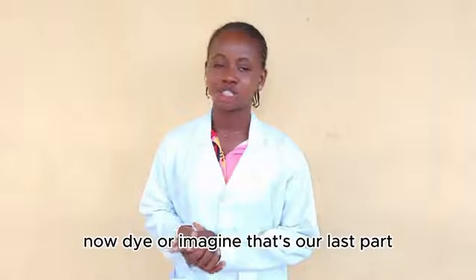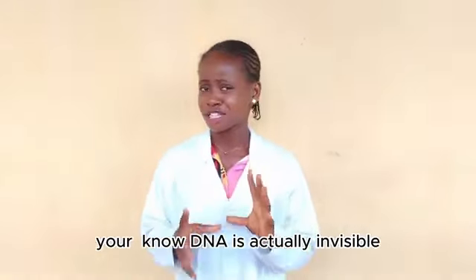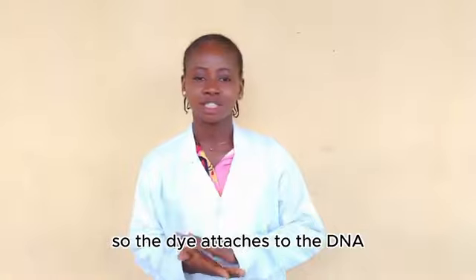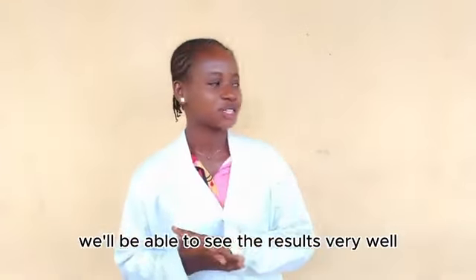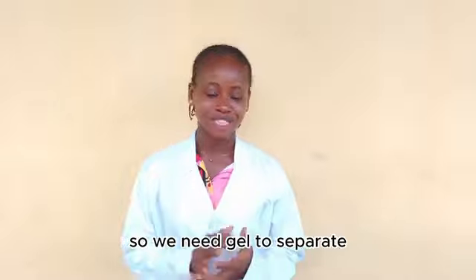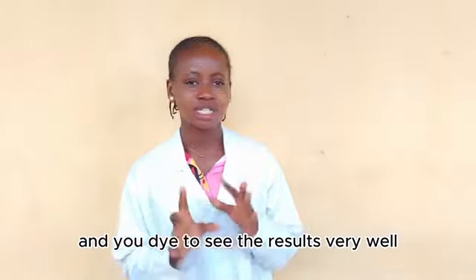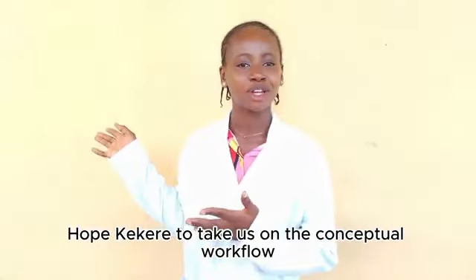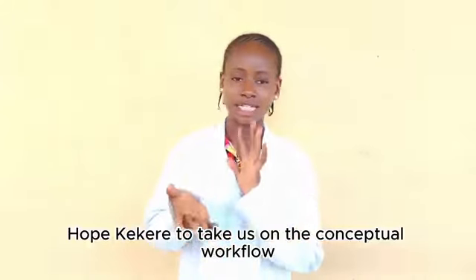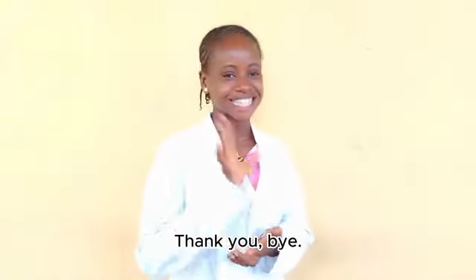Now, dye or imaging, that's our last part. DNA is actually invisible. So the dye attaches to the DNA so that when we put it under the light, we'll be able to see the results very well. So, we need gel to separate, electricity to move, and the dye to see the results very well. At this point, I will now call on my colleague Okekere to take us through the conceptual workflow stages of agarose gel electrophoresis. Thank you.